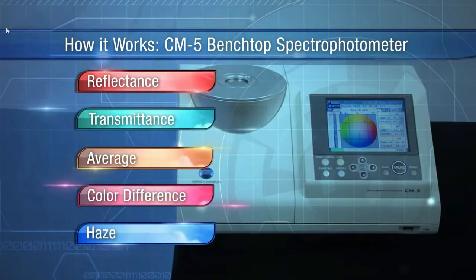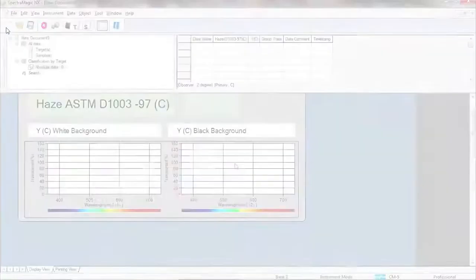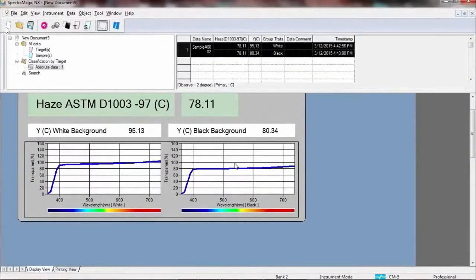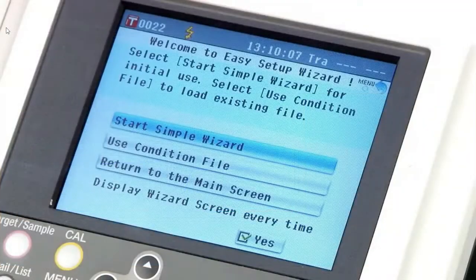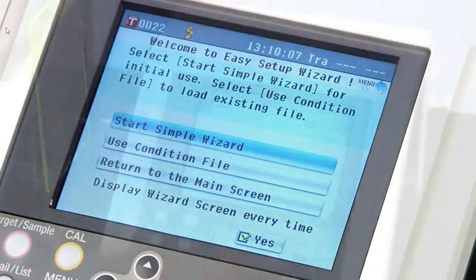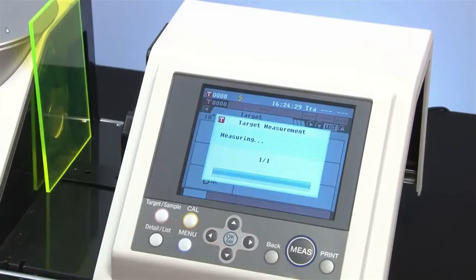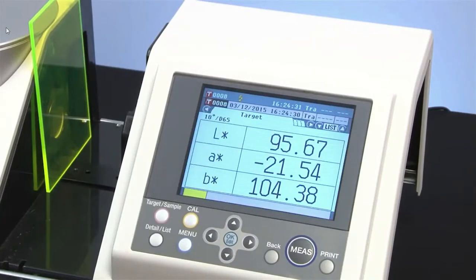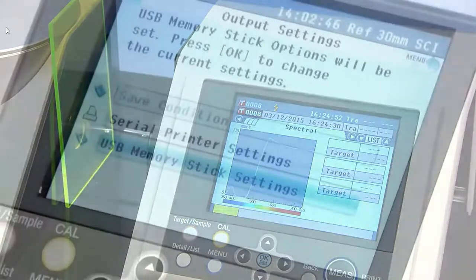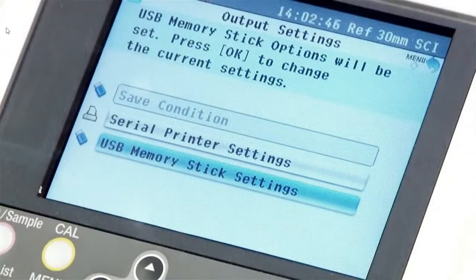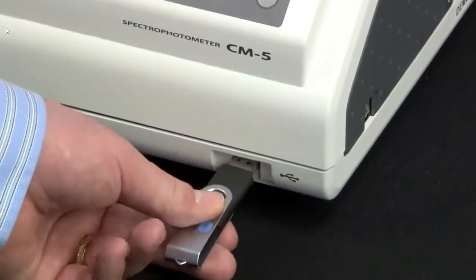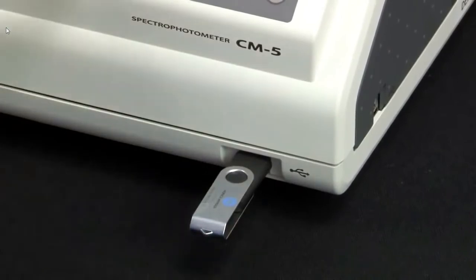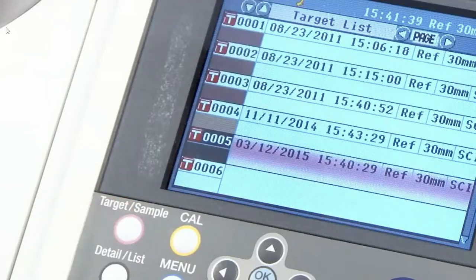Measurements are performed by everyday users or occasional users alike. Stored data can be saved to a USB drive, making it easy to switch users and save settings without manual setup each time. In addition to the USB feature, the CM5 can store 4,000 measurements and 1,000 target colors in its large memory. You can even switch language settings.